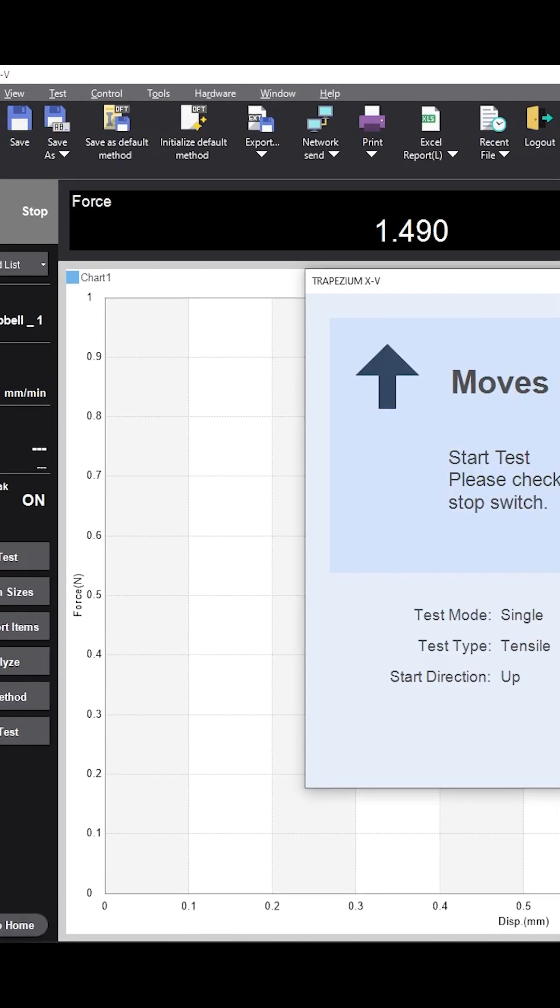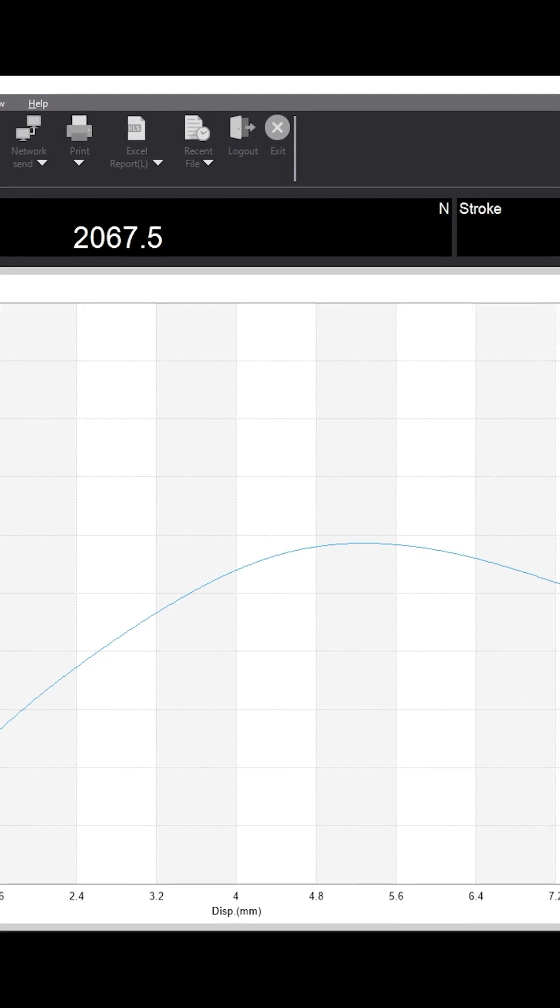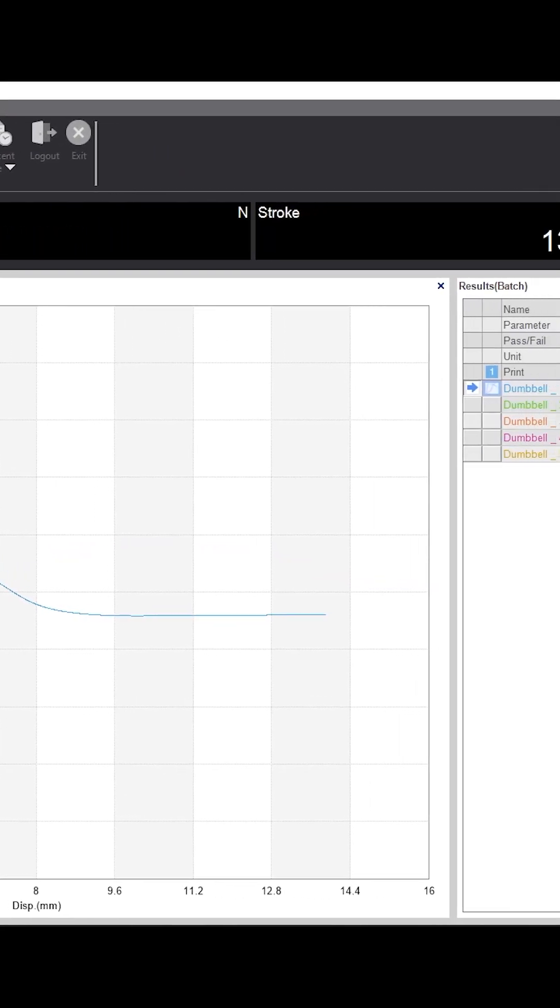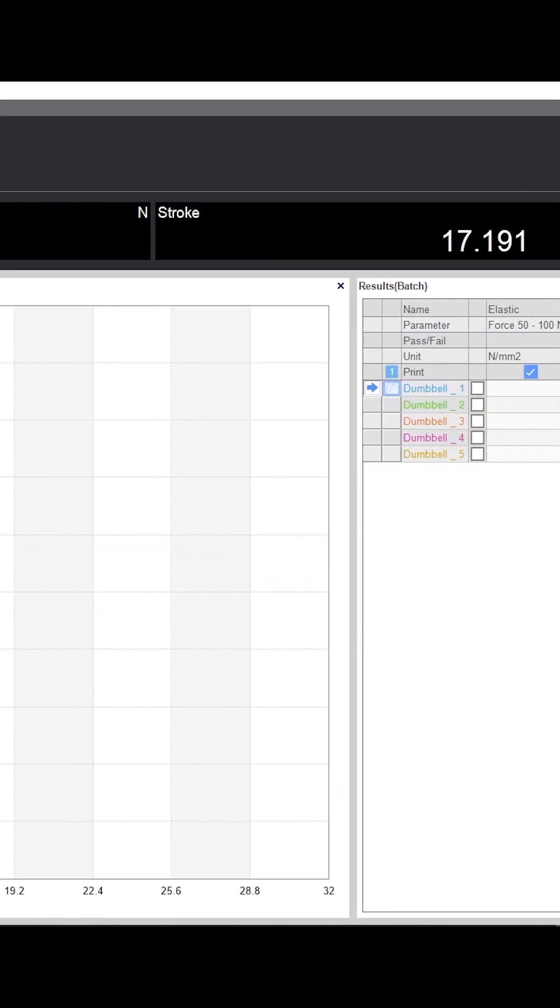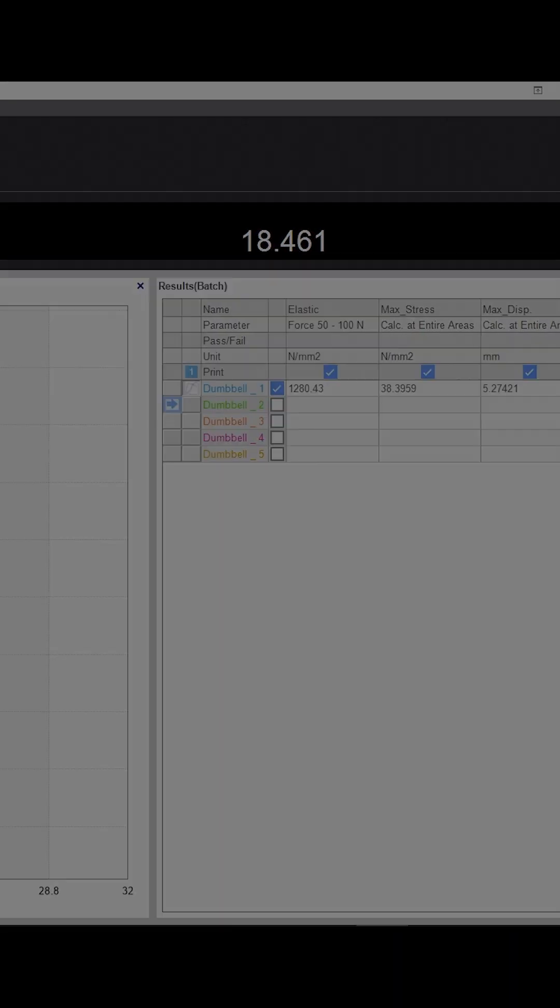Data analysis is made easy by Shimadzu's Trapezium XV software which allows for quick calculation of tensile strength, elongation, and modulus of elasticity.